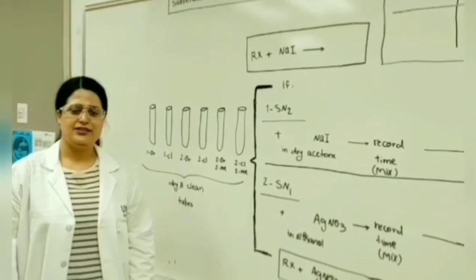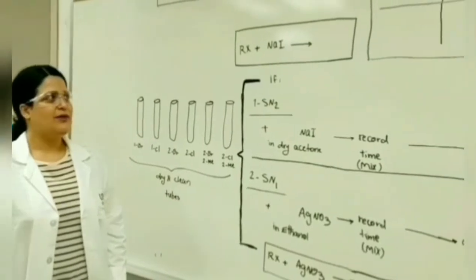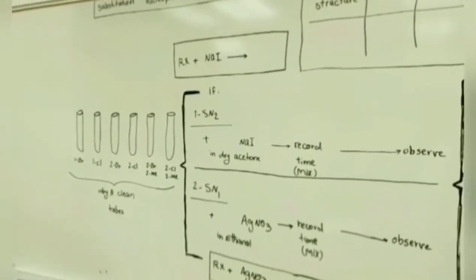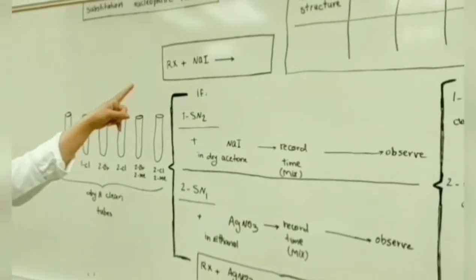Students, I'm Shahrzad. I'm your TA today. I will be taking you through a video lab for doing the experiment of substitution nucleophilic reaction. I have already drawn a scheme on the board for you.